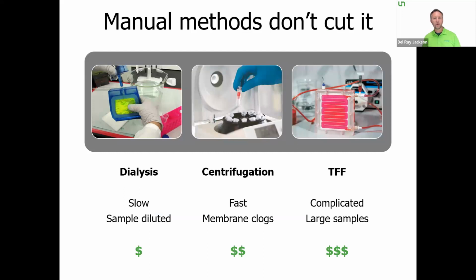And like many people that we talk to, you may be using manual methods for it. It's very understandable. Most of us have a fridge and a stir plate, so dialysis is very accessible. Same with centrifugation using spin filters. And then TFF is also an available technology that people are using for buffer exchange.